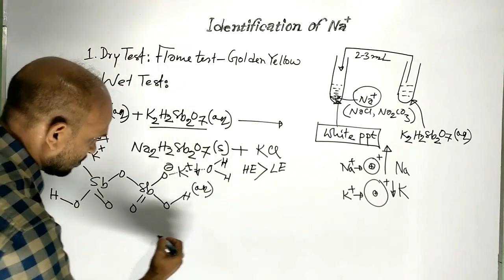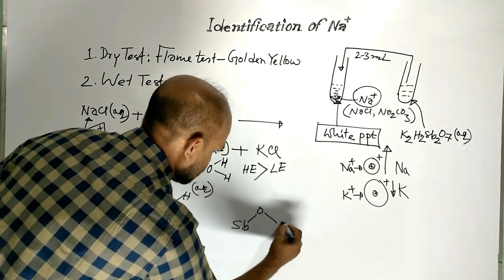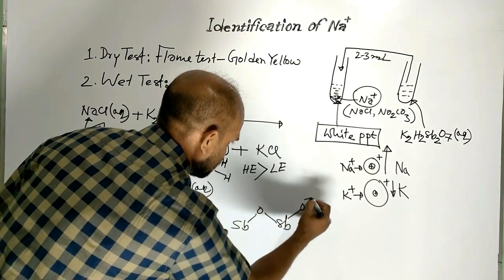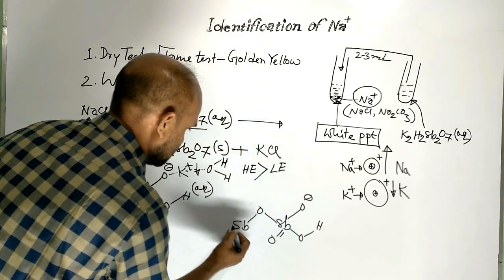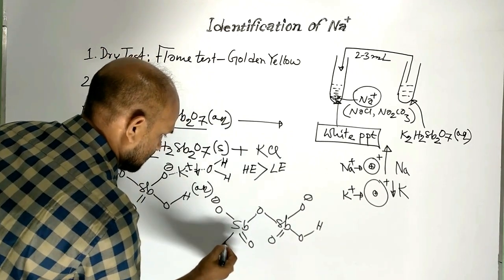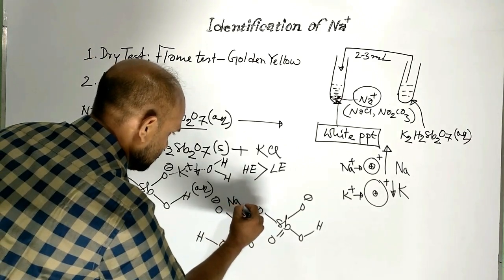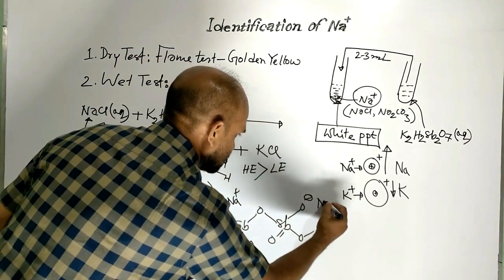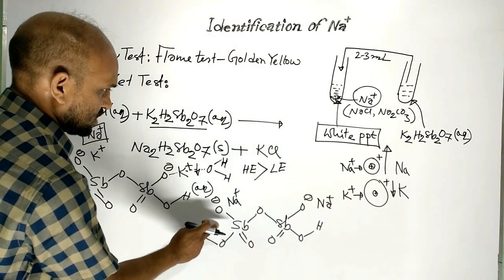But in case of sodium pyroantimonate, here sodium pyroantimonate.